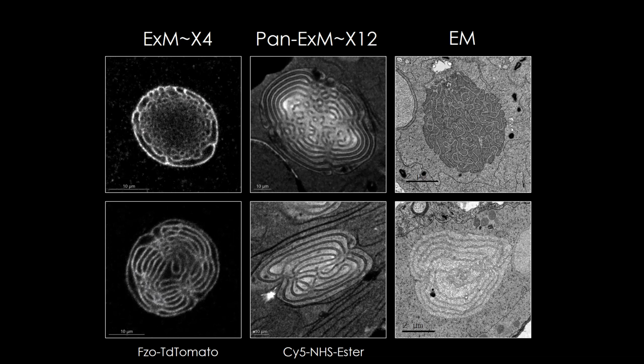Here you can see the comparison between the EM image and the expanded images. You can appreciate that the architecture is pretty similar, and there is not much distortion of the samples. So it's really nice to see that we get a similar result with the expansion technique.